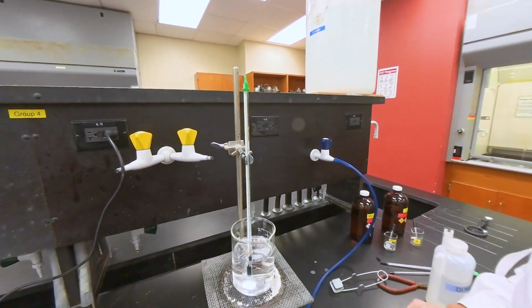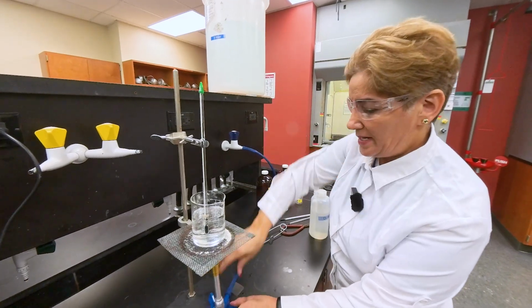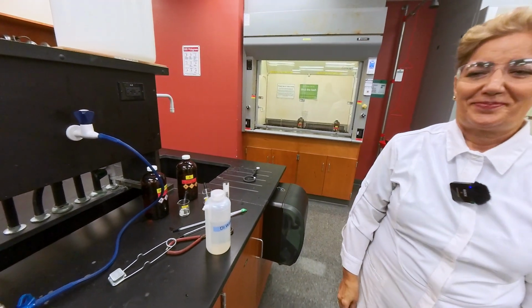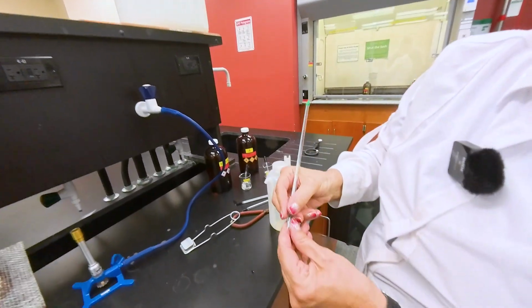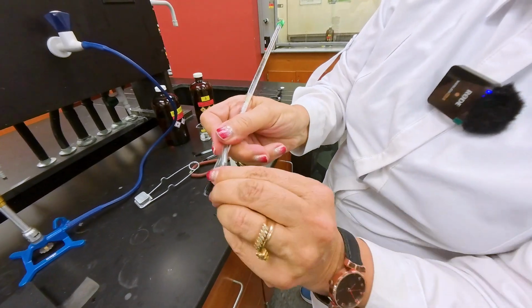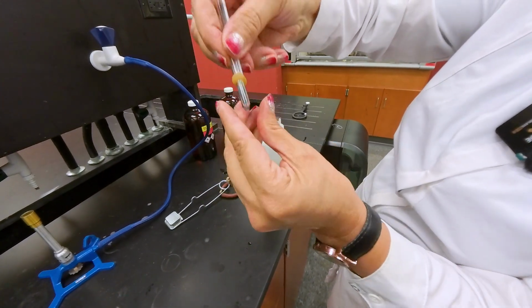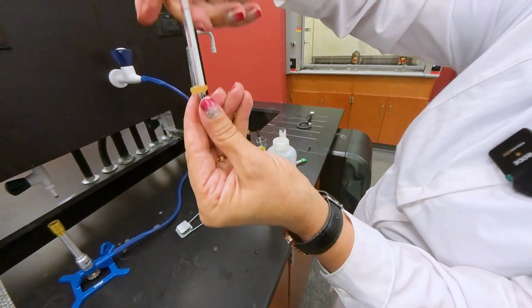Okay, we are now going to make a sample with our unknown, and this time we are using unknown A. For the unknown A, I need another seal tube. Okay, I need to attach the seal tube. This is for the unknown. The level of the seal tube, I like it to be very close to the thermometer bulb.